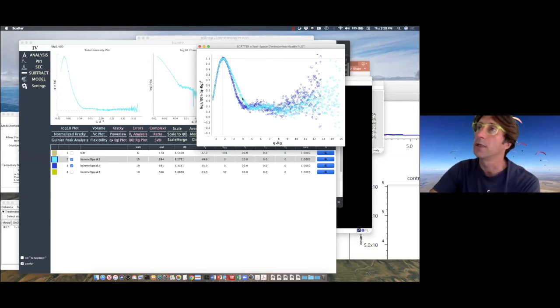Unfortunately, the larger particle seems slightly more unfolded, but it may also be a little bit more elongated. And that's exactly the difficulty sometimes, to say if the difference between the larger one, the cyan, versus the smaller complex is elongation, or flexibility, or unfolding.